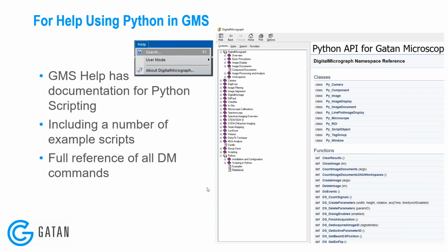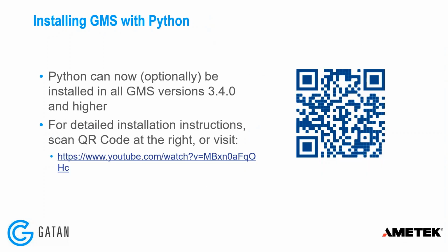All right, thanks, Ben. And then just to clarify, because questions continue to come in, some of which are related to the GMS version, which is needed to do the Python scripting. Could you comment on that? Definitely you need version 3.40 and higher.